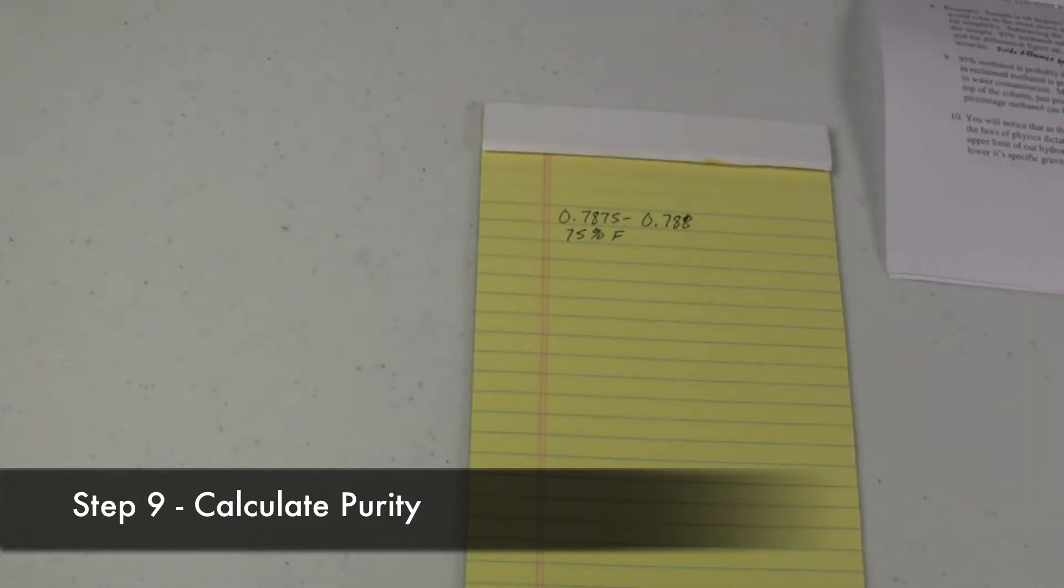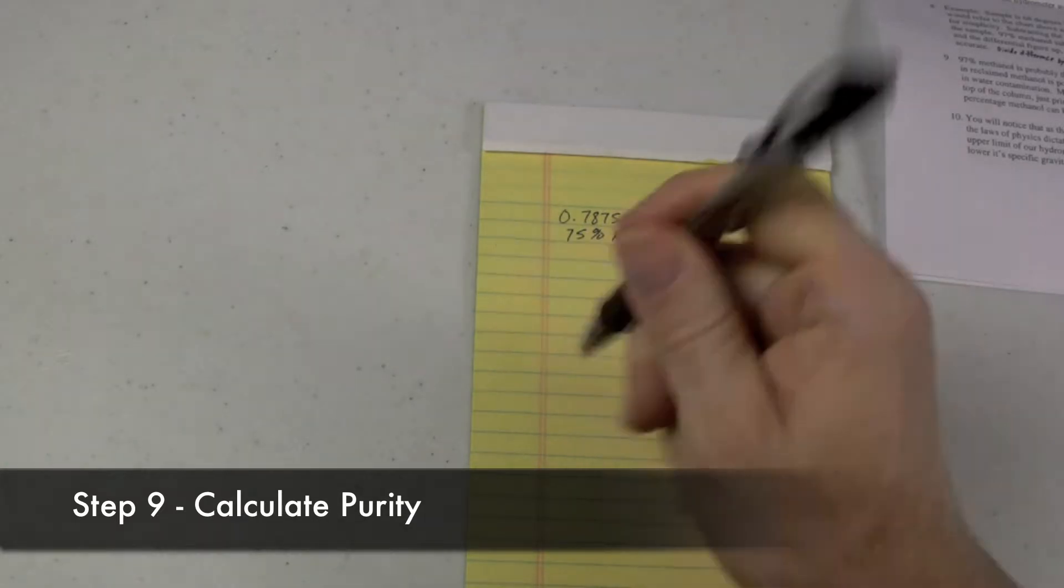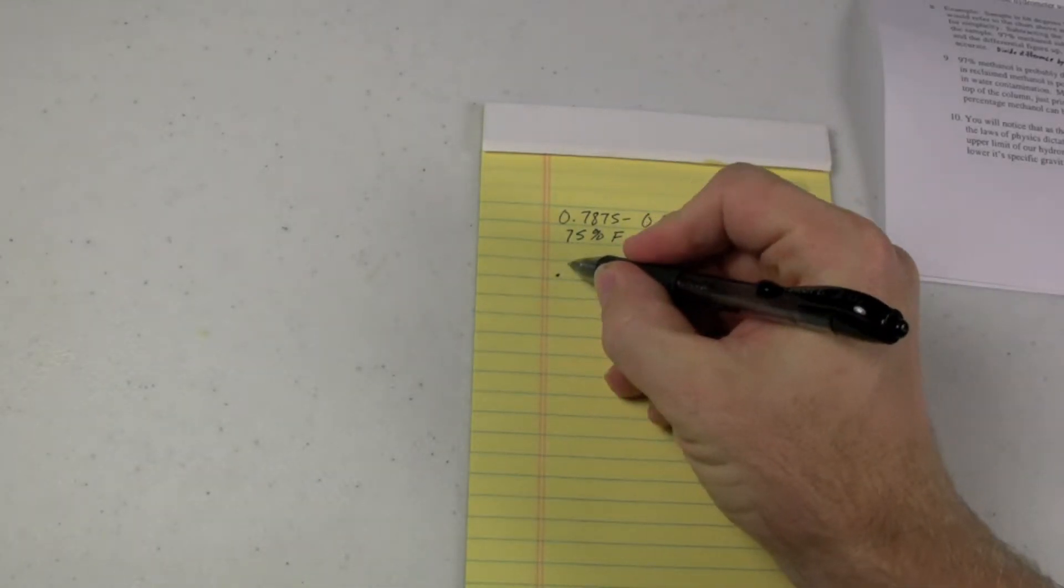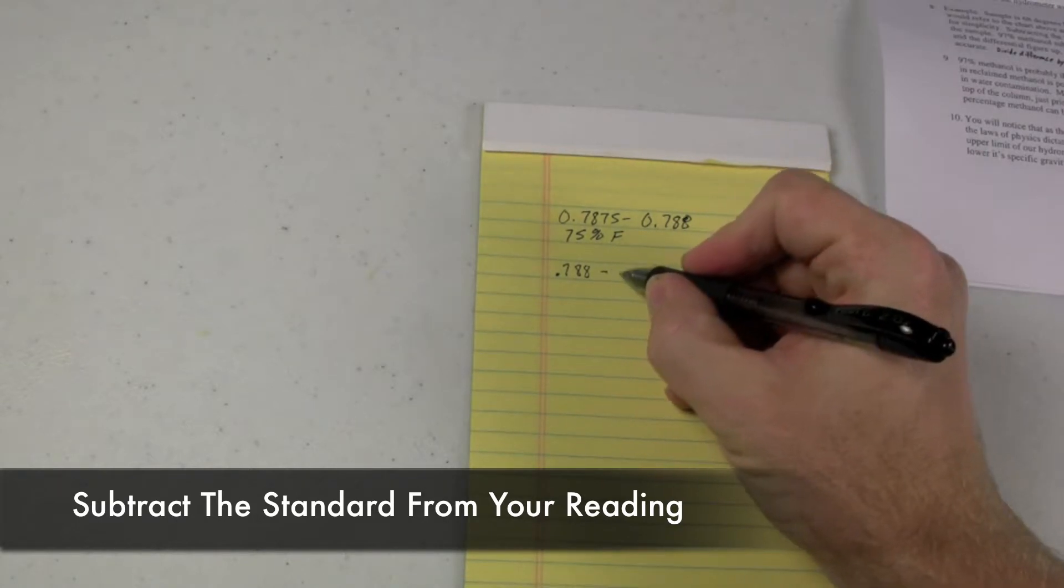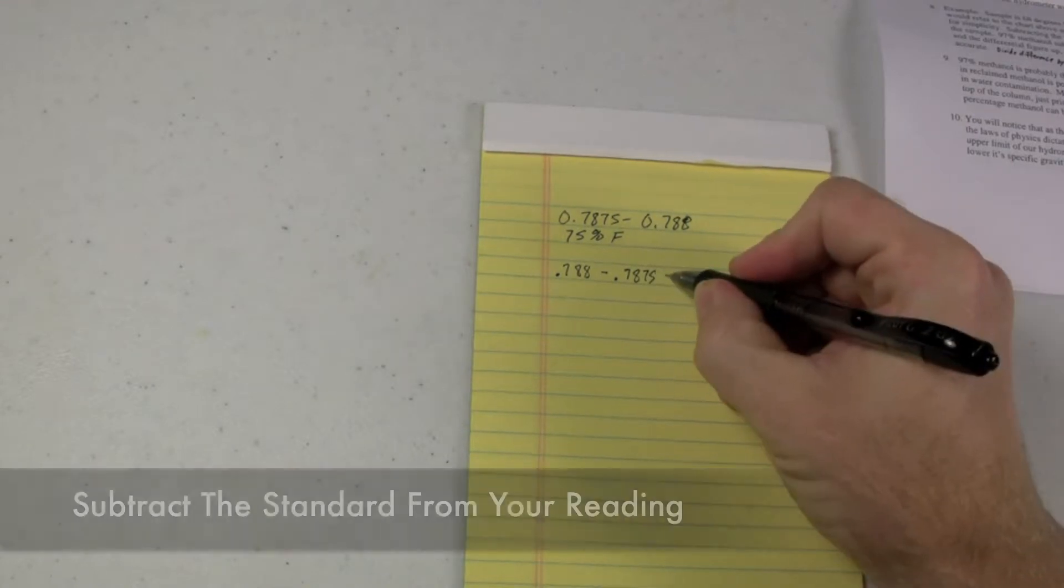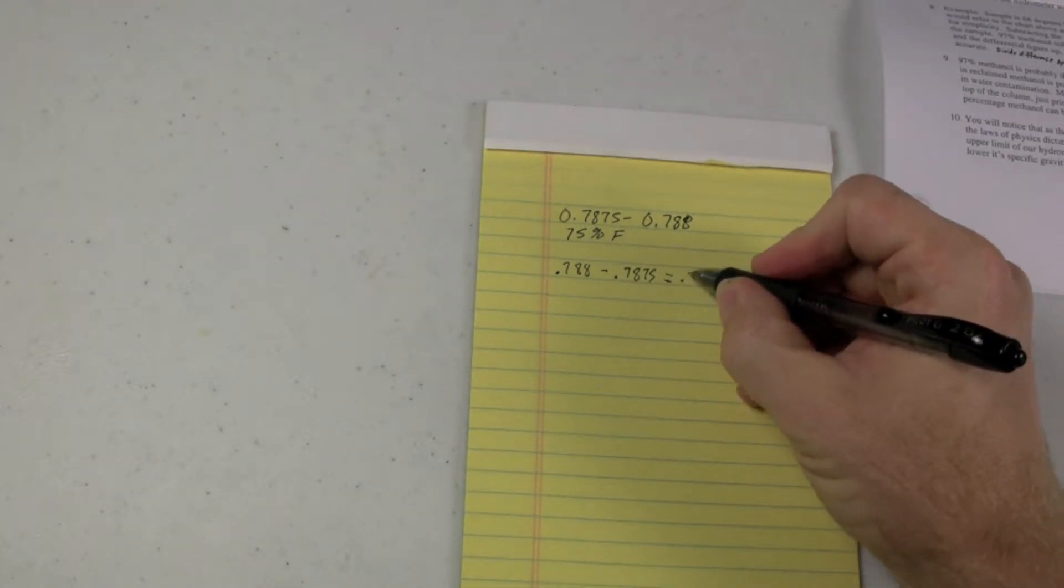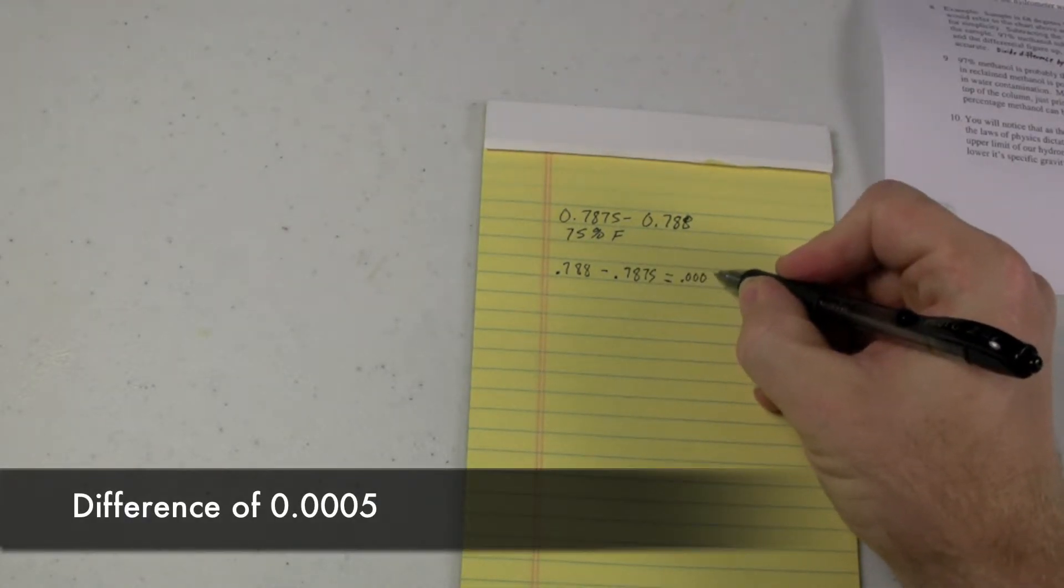So the way that you calculate your methanol is you would take the reading that you got .788 and you subtract from it what it should be .7875. That equals .0005.